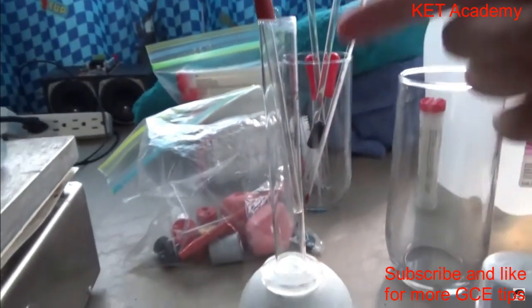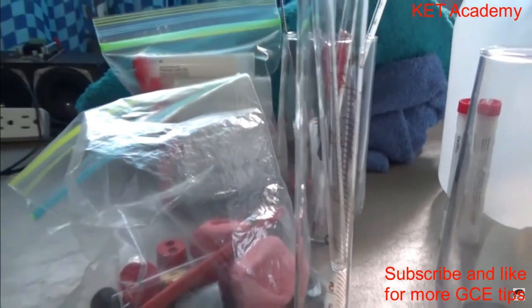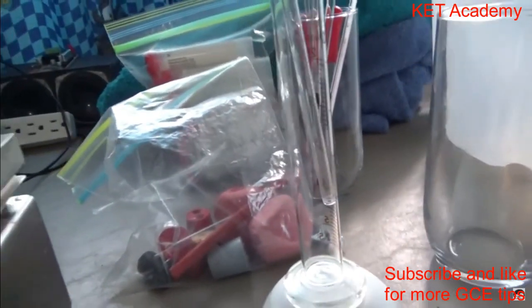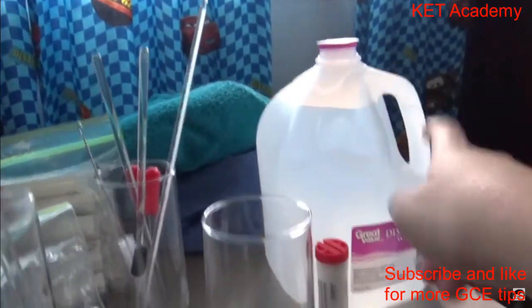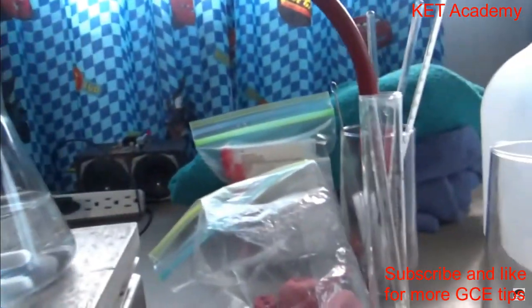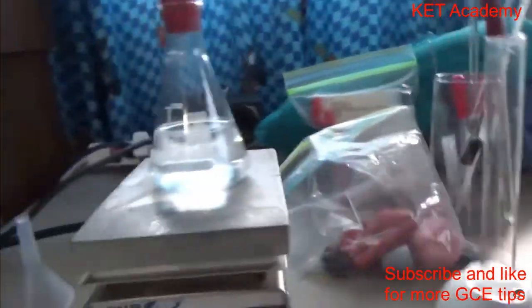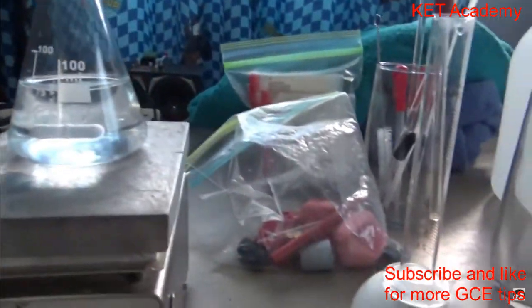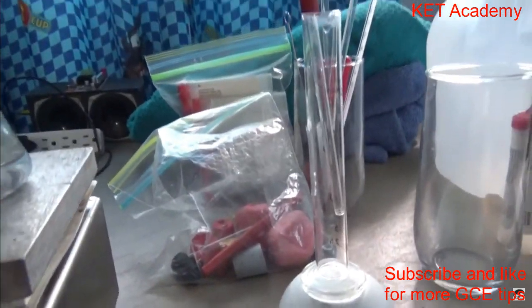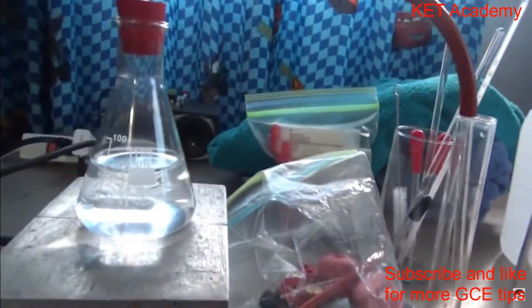This graduated cylinder, which I set on top of this mortar, is going to contain what's called lime water solution. And all that is calcium hydroxide in a solution of water. I'm using distilled water as always. What will happen is, if there is carbon dioxide present, it'll actually turn the lime water solution from clear into a milky color. So that is the plan. If that does not happen, then we could have a hydroxide, but I highly doubt it. Yeah, I do have more tests if this doesn't work, so that'll be just fine.